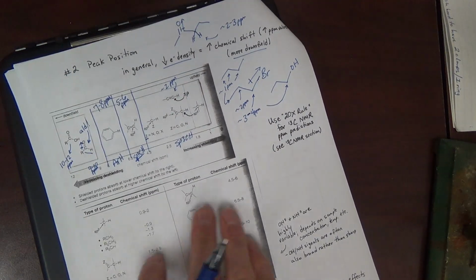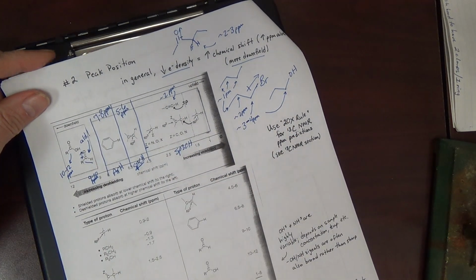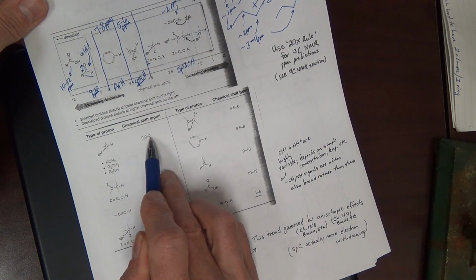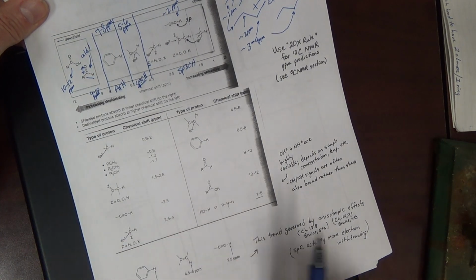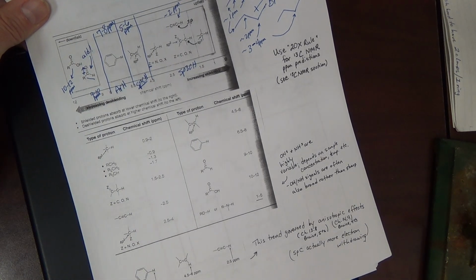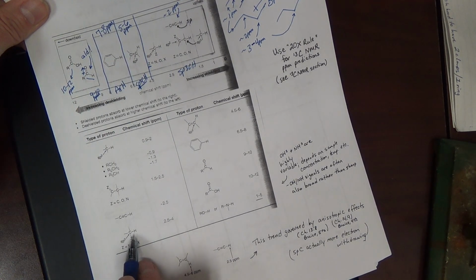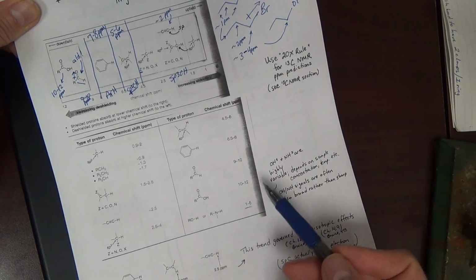Here's another table. It goes over the same thing we did, but more in table format. Type of proton, chemical shift. Plain old sp3 CH is about 1 to 2 ppm. You don't have to get so much in detail. Ultimately, once you start working problems, you'll learn what level of detail you need to know. We mentioned these. There's your sp3 CH. Electron withdrawing group on the carbon where the H sits. Everything's here, right? Aldehyde 9 to 10.